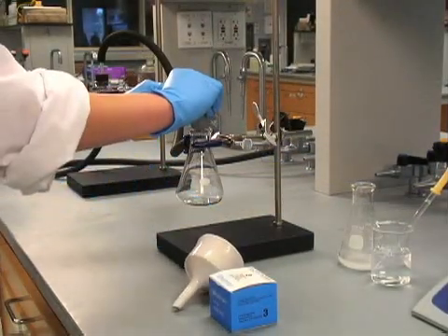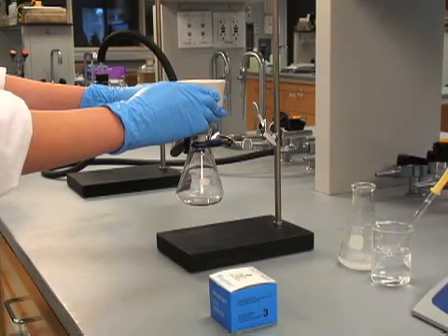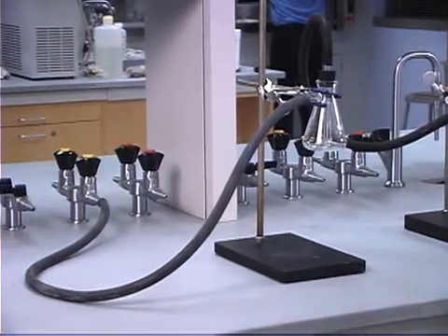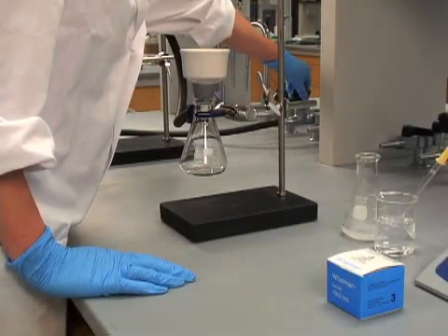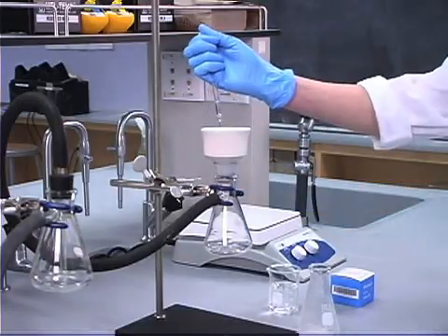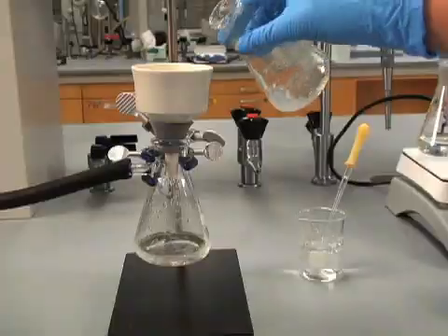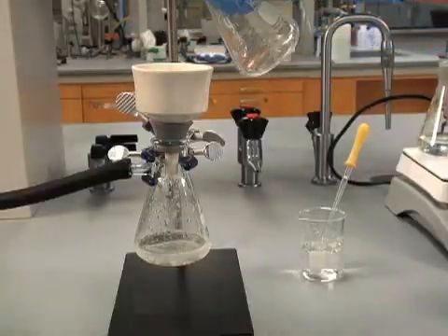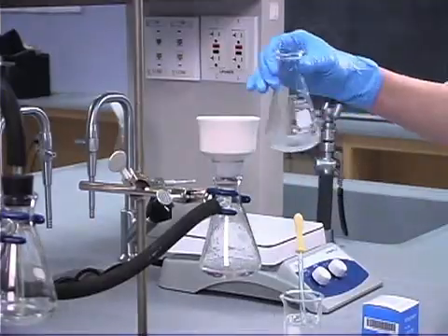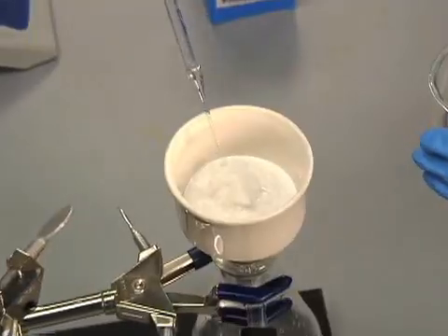We're now ready to separate the crystals by vacuum filtration. Placing a trap between the filter flask and the vacuum line helps protect the vacuum system. Now open the vacuum. To ensure that it is sealed to the funnel, wet the filter paper with a small amount of cold solvent. Rinse the flask with cold solvent and transfer it to the filter. We can wash the crystals with a small amount of cold solvent.